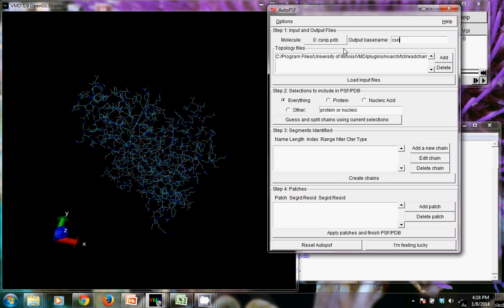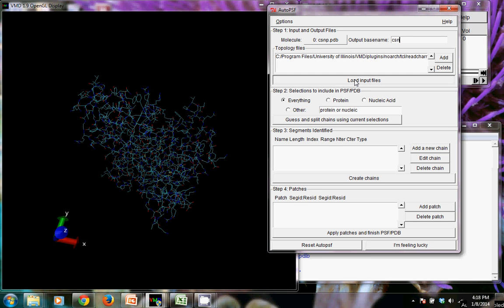For basic molecules that don't have any additional things like ions, sulfates, ATP, and things like that, we can just leave the topology file as it is. And then what we want to do is click load input files. Just do that once. It does happen even though it doesn't show you that anything happened.